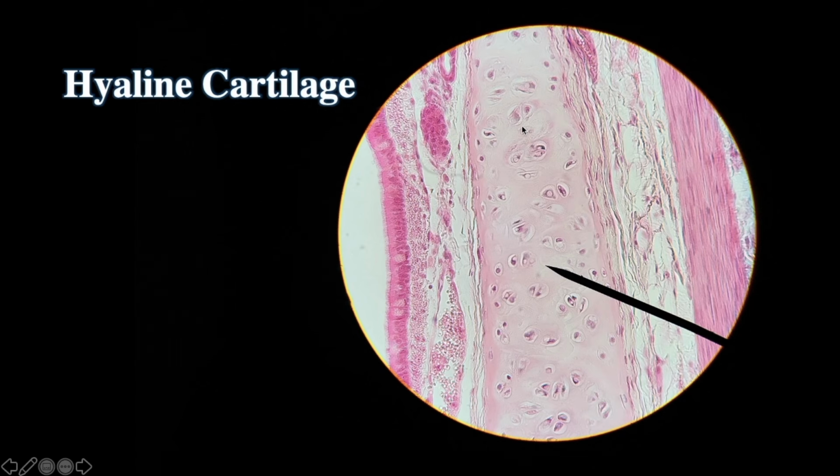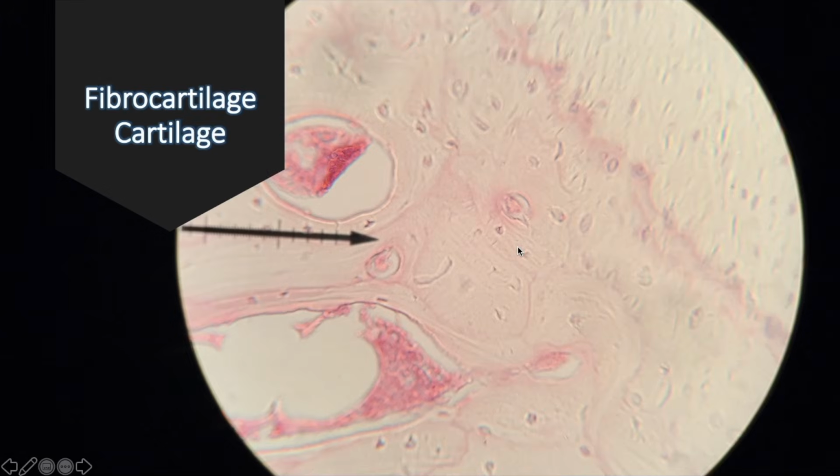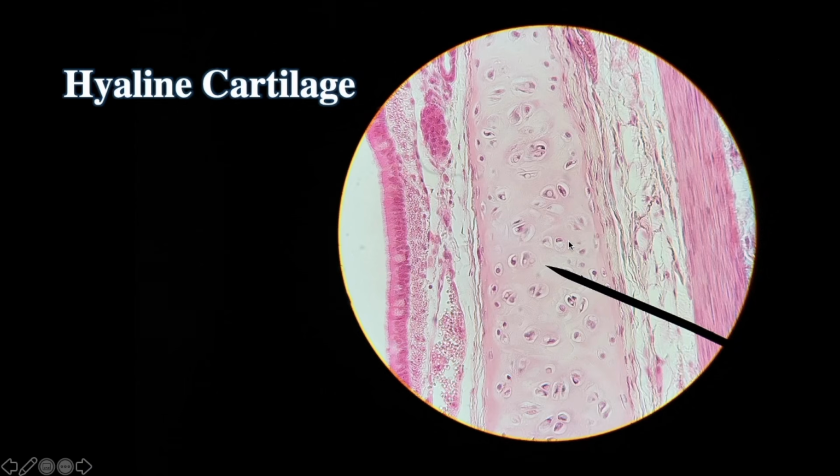Whereas the next tissue that I'm going to show you, this is fibrocartilage. And in the matrix, you do see streaks. Also, the lacuna are more slender-like. They almost look like eyeballs in the eye socket, like eyes that you would draw. Oval shape, kind of. Whereas with the hyaline cartilage cells and their lacuna, they're more plump and round. You see that?